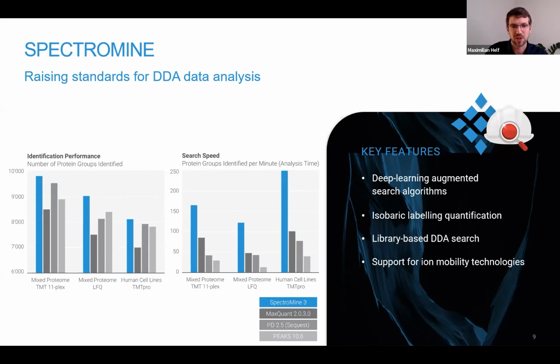And before I hand over to Tikira, I have a polling question for you, just so we can get to know the audience a little better. And the question is, have you used SpectroMine before? Yes or no? And I will just wait a little bit to see the answers come in before I continue.